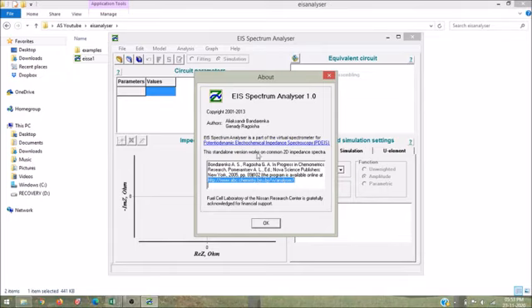You also can download it, and most importantly, you don't need any access to the internet while you are using the application, and you also don't require any instrument, like a potentiostat or electrochemical workstation, connected with your PC or laptop while you are fitting using this application.